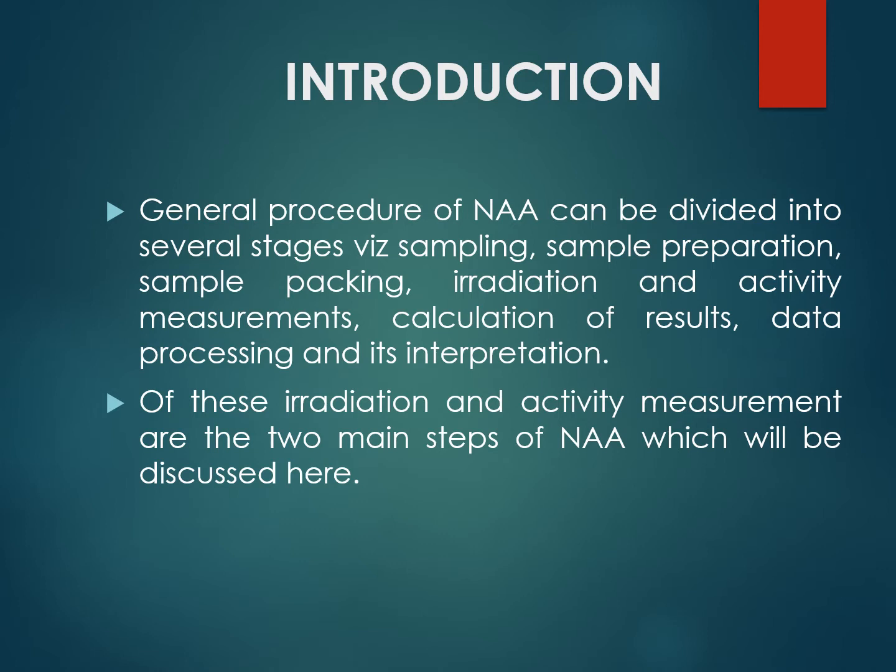If from that lot sample we take some amount, then we consider that as a bulk sample. And when from that bulk sample we consider a specific amount for the sample preparation technique, to prepare the sample in a lab, then we say that this is the laboratory sample.